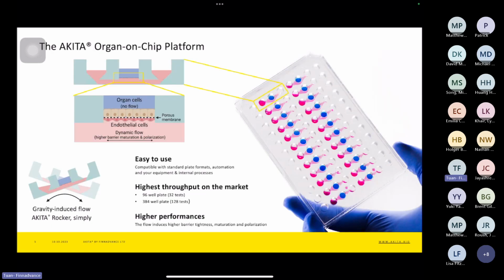As a breakdown of the structure of the platform, we have the well-plate format. As you can see, now we have an example of the 96 well-plates. With that, we connect multiple wells together as a microfluidic unit. And we have the inlet and outlet connecting the bottom microchannels. We induce the flow into the microchannels, and then we try to mimic the blood vessel with endothelial cells on the bottom. And then on top of the microchannel, we have the porous membrane, where we can then have another cell type on top of that, confined inside of open top chambers.